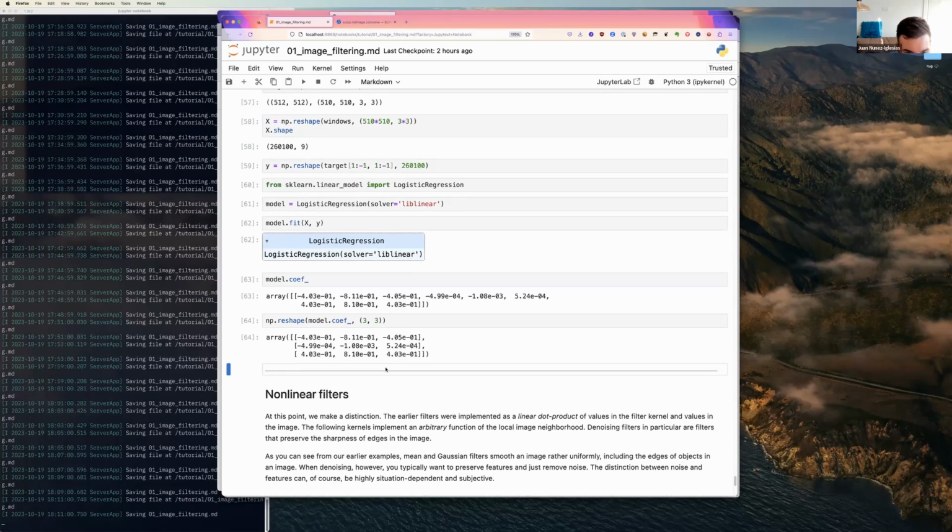And this is looking a bit easier to make sense of. I still wish NumPy would not print with exponent notation, but the -1 means this is 0.4. So this is -0.4, -0.8, -0.4. These are much smaller values, so we can ignore them. And this is 0.4, 0.8, 0.4. We can multiply by 10. Let's see what happens if we do that.